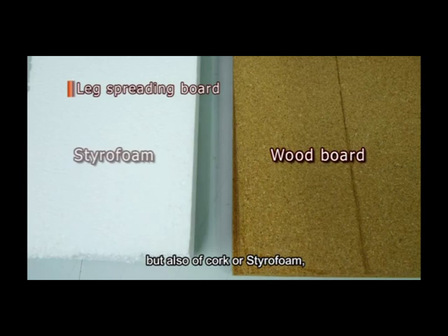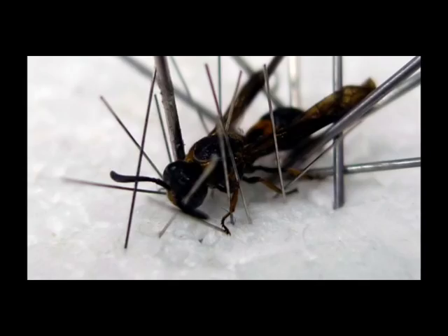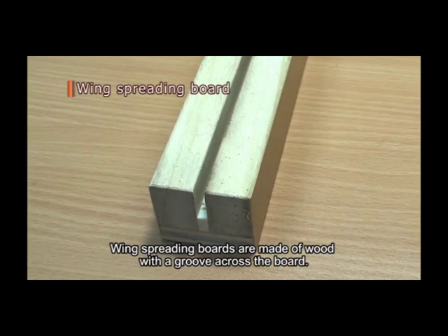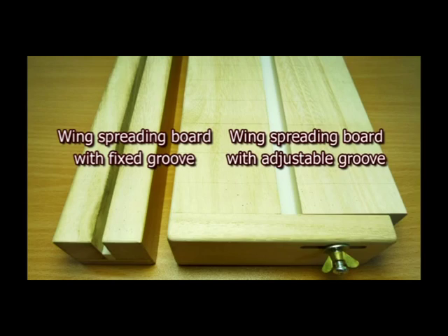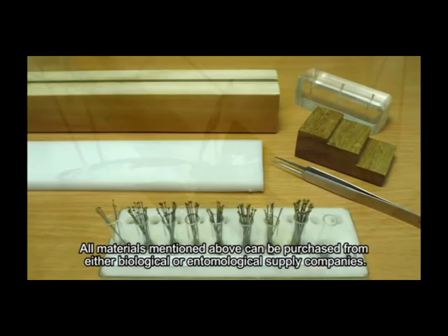Leg spreading boards, which are generally made of wood but also of cork or styrofoam, are used so that the insect's legs will project out from its body, allowing for easy examination of the taxonomic characteristics. Wing spreading boards are made of wood with a groove across the board; the width of the groove may be fixed or adjustable.